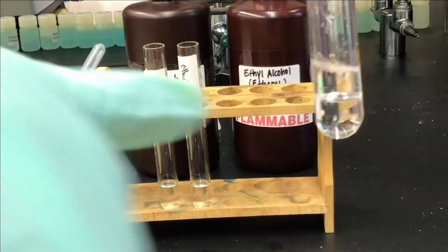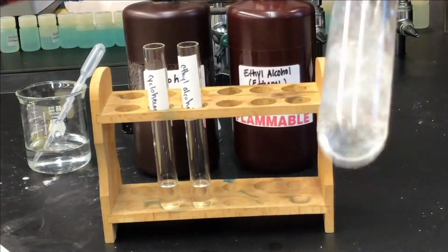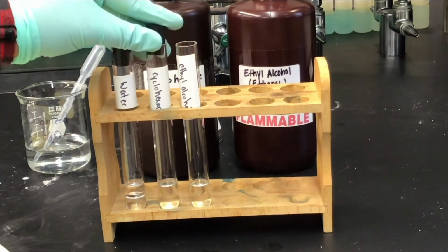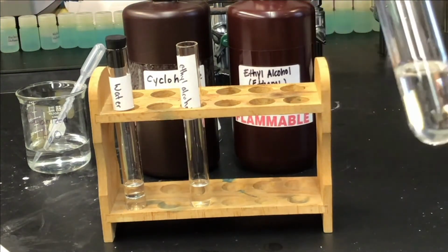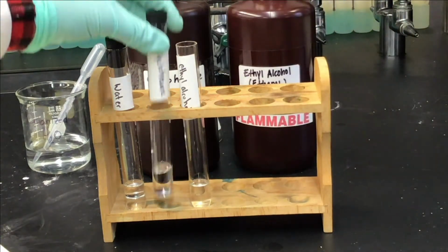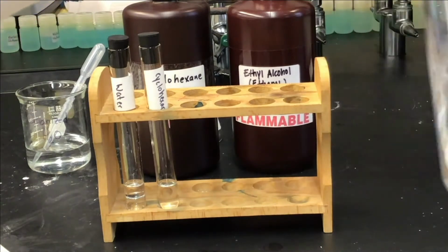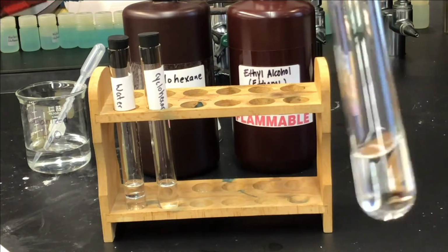With our toluene added to each test tube, we're going to stopper and shake and see if our toluene dissolves in our solvent. Starting with water, we see 2 distinct layers formed between the water and the toluene. Next, we're going to stopper and shake our test tube with toluene and cyclohexane. We see no layer like we did in the water. It is a clear, colorless solution. Now we're going to stopper and shake our ethyl alcohol and toluene test tube. And just like our previous test tube, we have a clear, colorless solution.